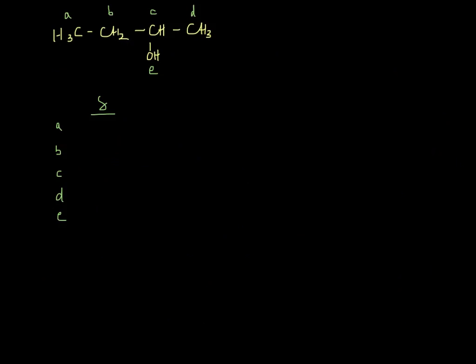All right, so of note, chemical shift, let's start at the bottom. With OH, we don't really know where it's going to be. Usually it shows up somewhere between 2 and 5 ppm. I would like you to not necessarily get in the habit of guessing that, so 2 to 5 ppm is fine. That way when we do this backwards, if you see it at 2.2, you're not surprised. Don't go ahead and guess anything. Just assume it's somewhere in there. We can usually find it, mostly because those guys don't split with anybody, and they'll just integrate out to 1.